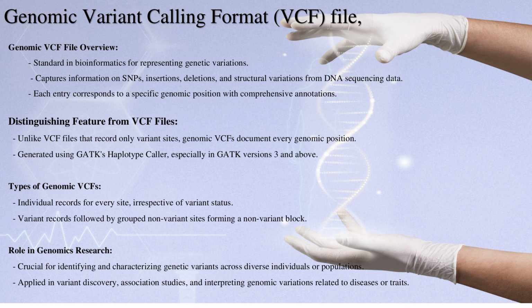Genomic VCF files play a pivotal role in genomics research, facilitating the identification and characterization of genetic variants across diverse individuals or populations. These files find application in various contexts, including variant discovery, association studies, and the interpretation of genomic variations in relation to diseases or traits.